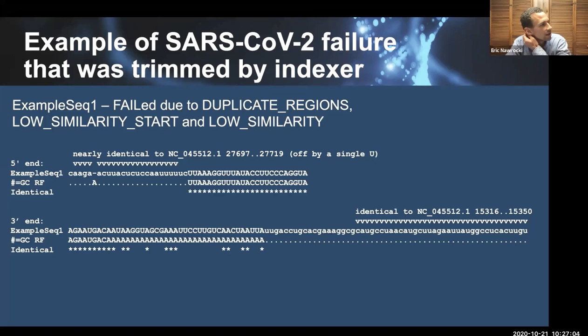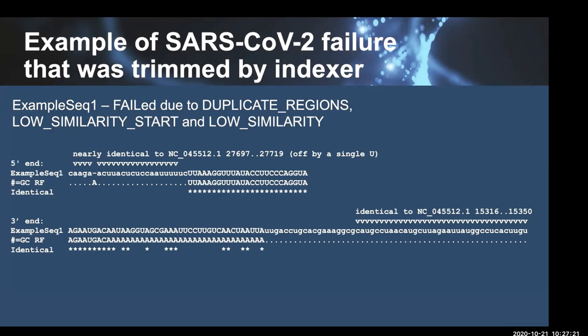So I guess you're talking about the boundaries of the annotation, like, if you had a stretch of Ns at the end of a CDS, that the boundary would be an N? Is that what you mean? So like the boundary of the gene might be artificially guessed in that QA/QC step, but that might also make it into the table file, which I would then upload to GenBank.